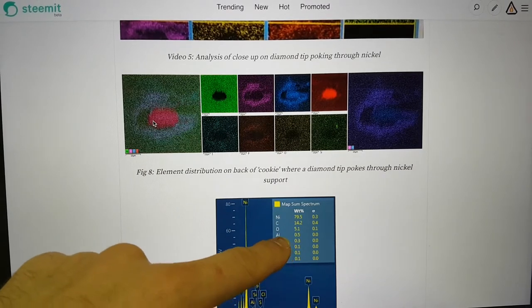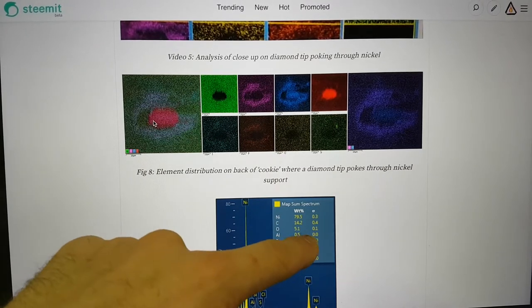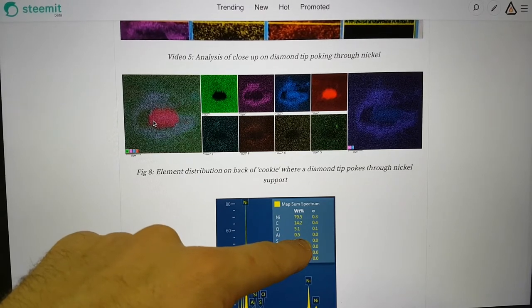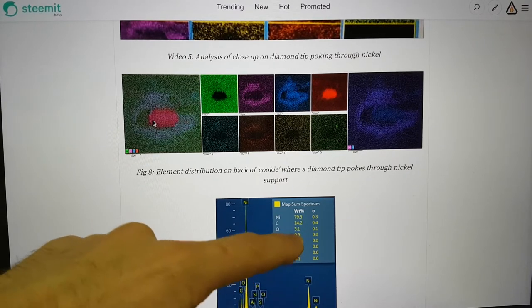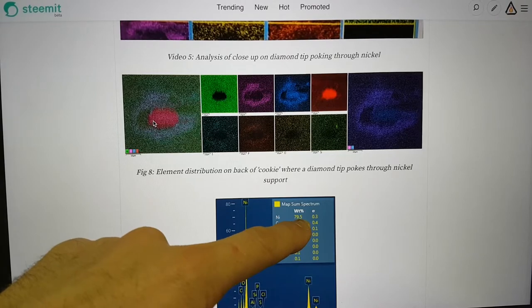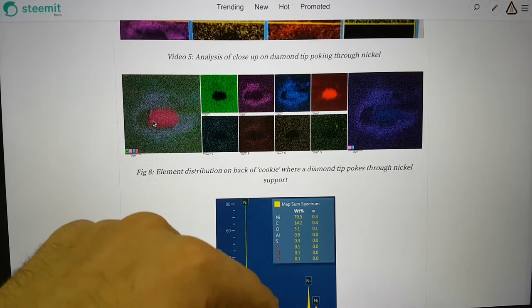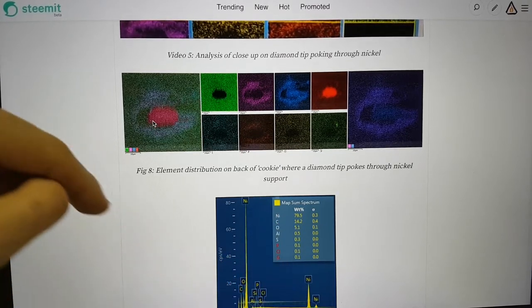It seems fairly confident that whatever this aluminum swirl is coming towards the diamond, it really does exist. Obviously most of what is in the field of view by weight is nickel and then carbon, oxygen and so forth.